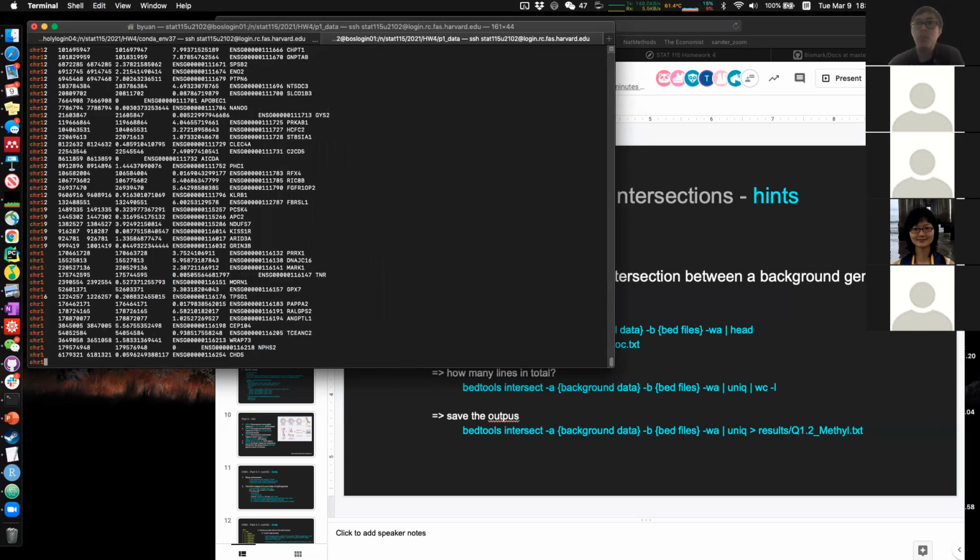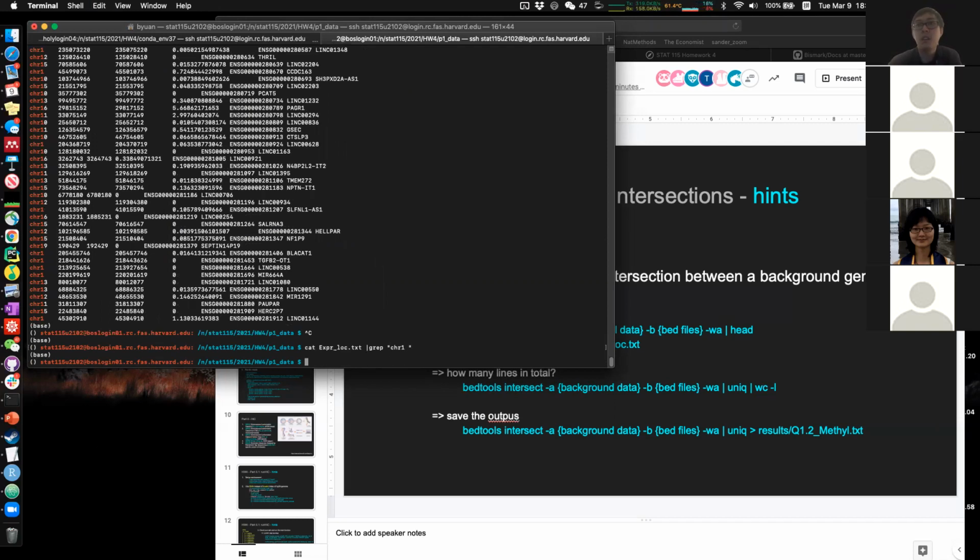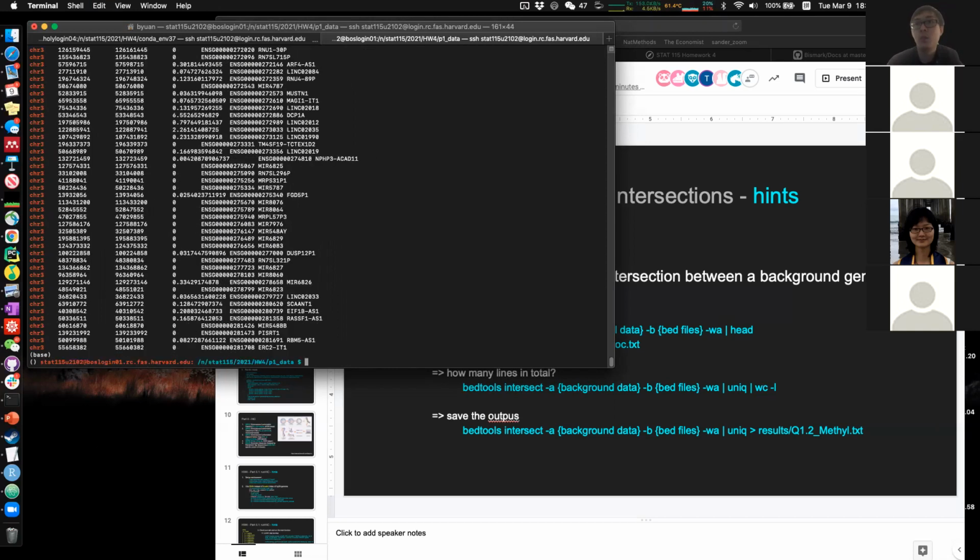That would give you a lot. Let's try chromosome 3. That would give you only chromosome 3. Now you're interested in the first 100 genes on chromosome 3 that we have from this expression.